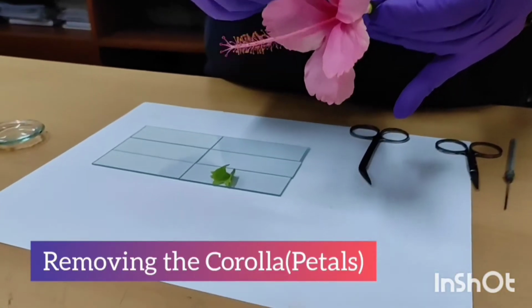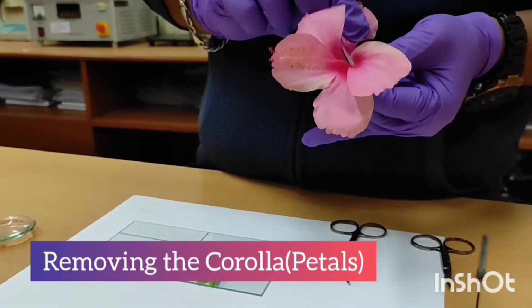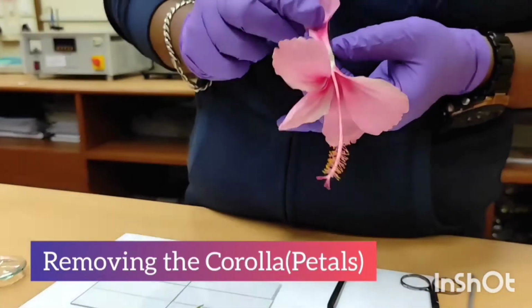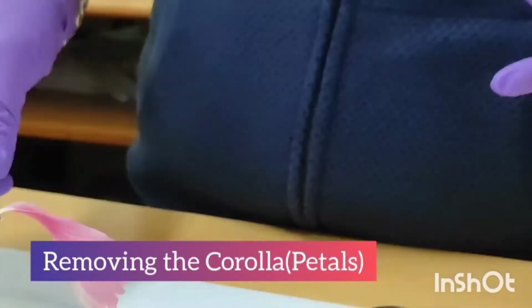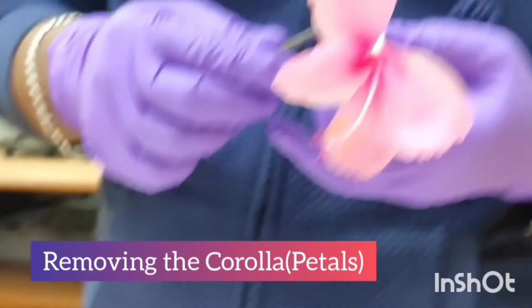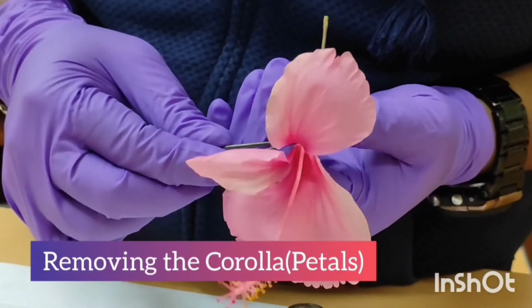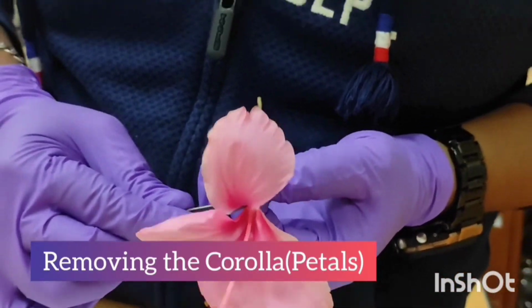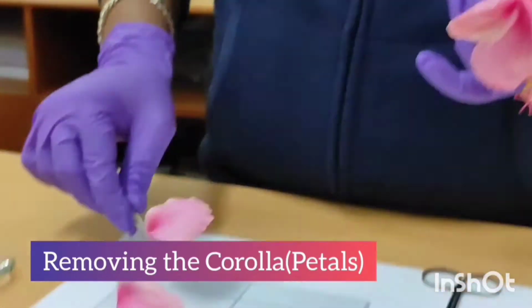Now, using the forceps, I am removing the petals. You can see the petals are free, so we can call this flower as polypetalous flower also. Five petals are there, so this flower is pentamerous in nature.